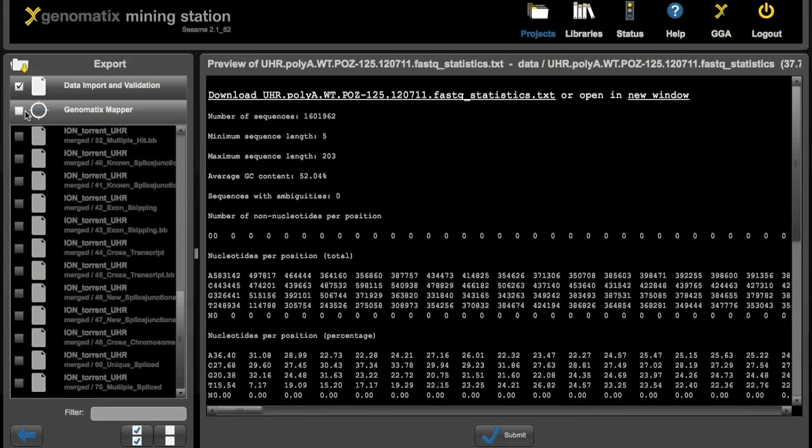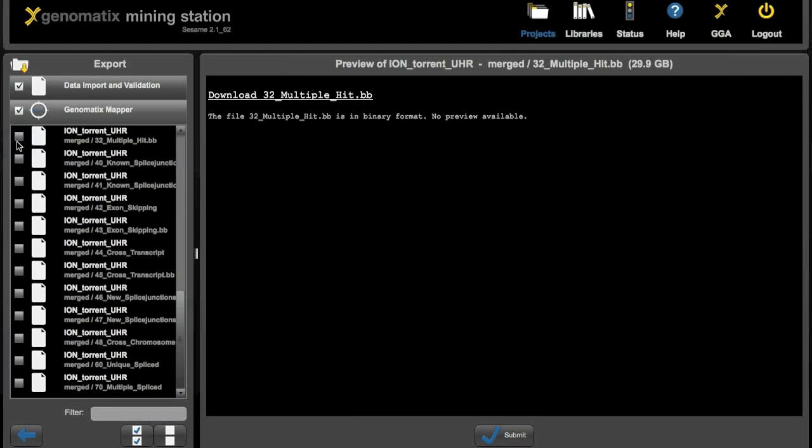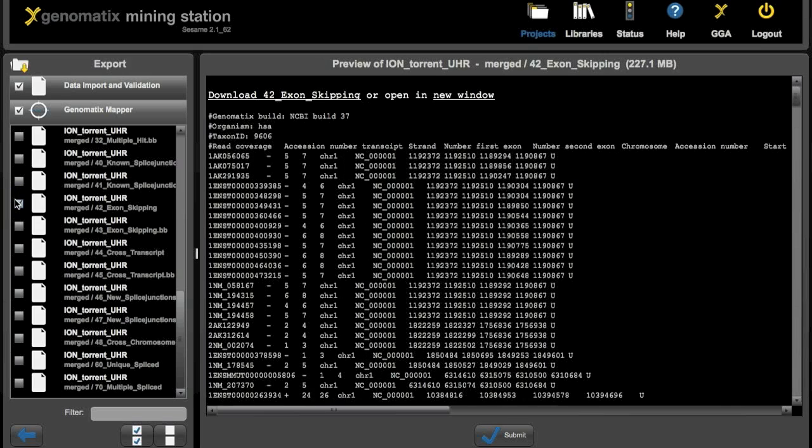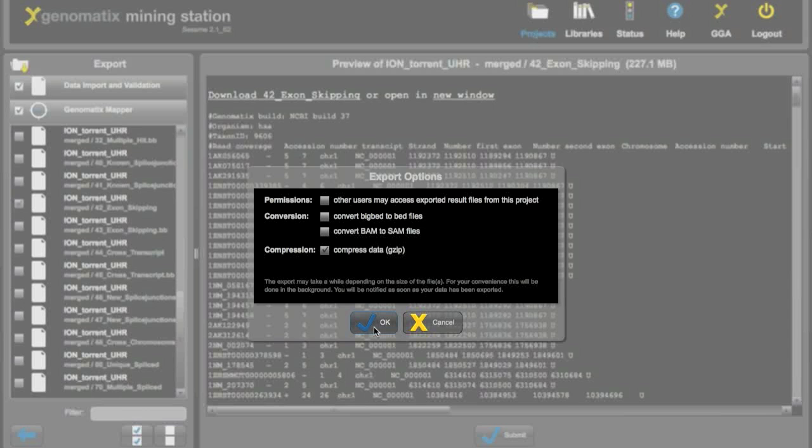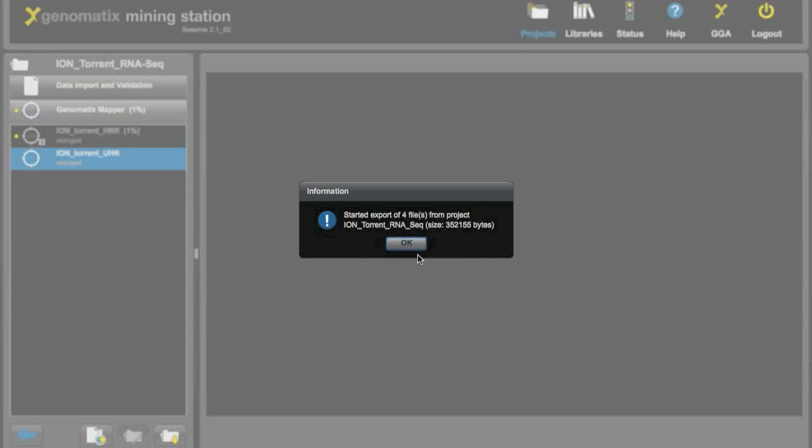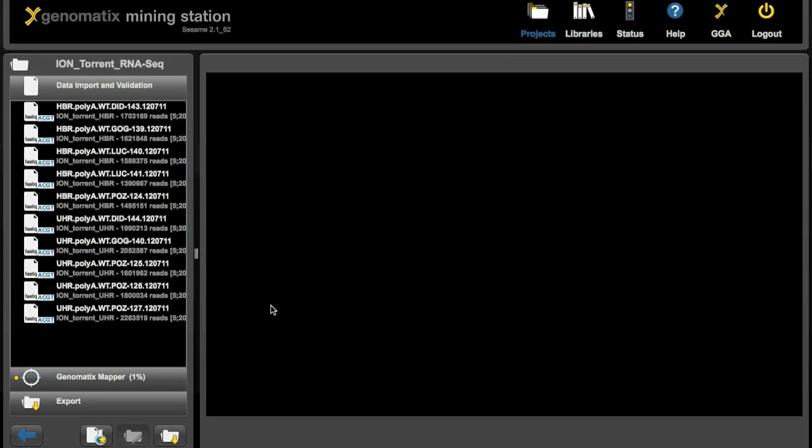And to export any files from the mapping just select Genomatics Mapper here. For binary files like BigBed or BAM there is obviously no preview. But for any text files that the Genomatics Mapper produced you will also get a preview on the right. As soon as you have selected all the files you want click the submit button. And now you can choose if you want to convert any files or if you want to compress them using gzip for example. And clicking OK here will start the export and all the selected files will be written to the designated output folder.